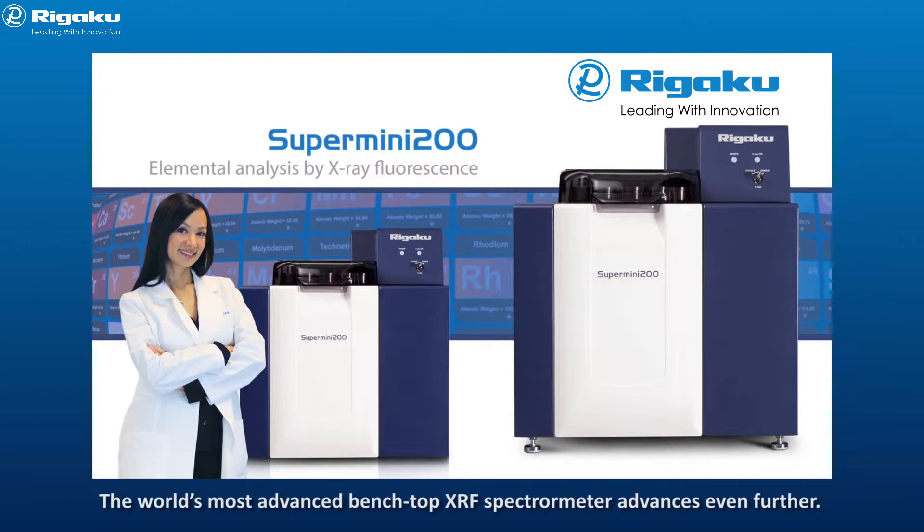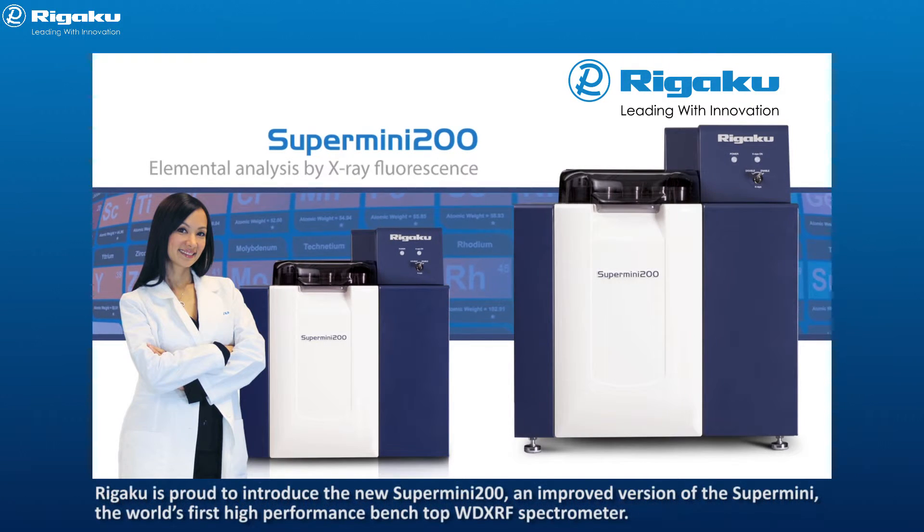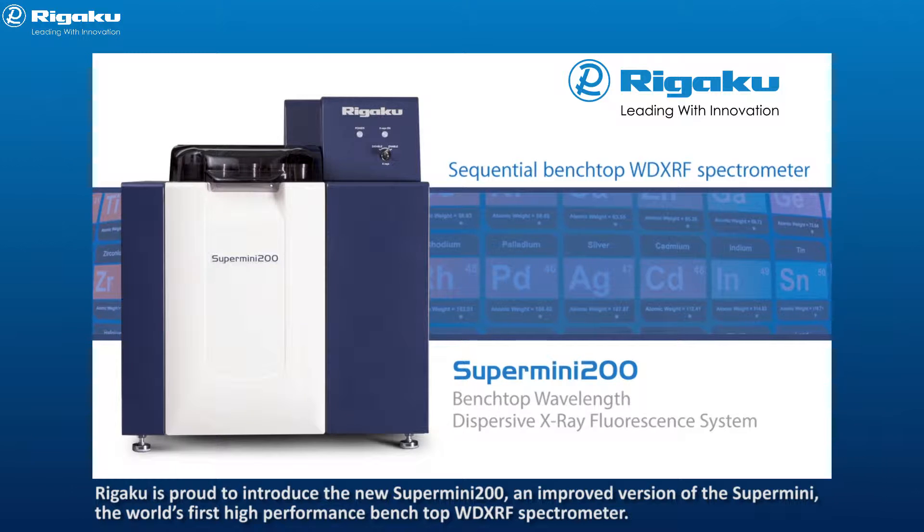The world's most advanced benchtop XRF spectrometer advances even further. Rigaku is proud to introduce the new Supermini 200, an improved version of the Supermini, the world's first high-performance benchtop WD-XRF spectrometer.